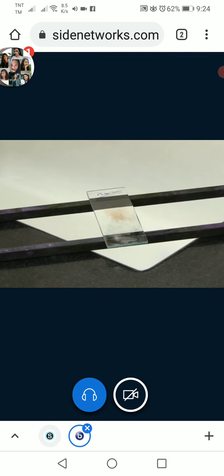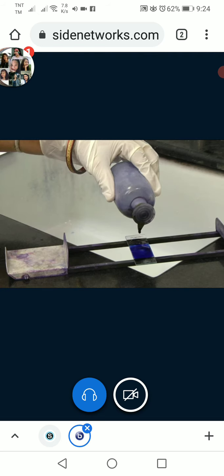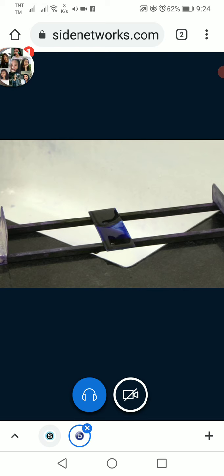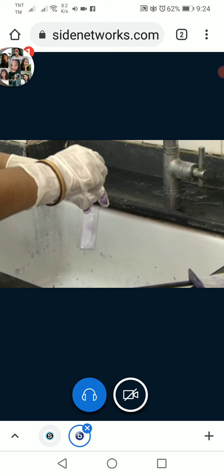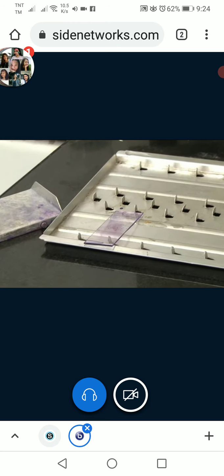After the smear dries, label the slide on the thick edge of the smear with another glass slide or a diamond marking pencil. This is done as the earlier markings can be washed away while staining. Add 7 to 8 drops of Giemsa stain. Let the stain stay on the slide for 20 to 30 minutes. Rinse gently for 3 minutes in buffered water. Drain, dry, and examine.